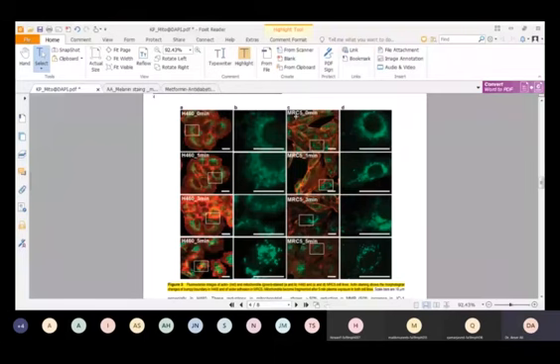And the case is the same for these MRC5 cells. You can see this is the control sample, and this one is the 5 minute treated sample. In this treated sample, the cells are wider than this control one. In control, the cells are mostly long, right? However, here they are more or less spherical. They are broader in shape. So you can check the morphology by using the actin staining, as they did in this data.